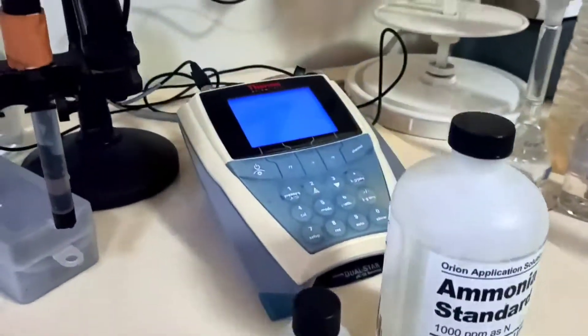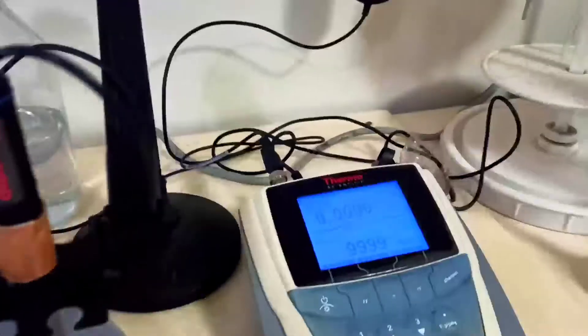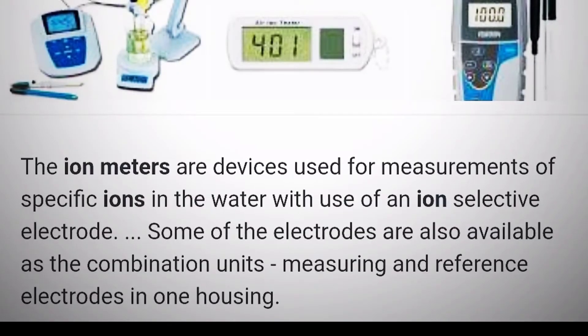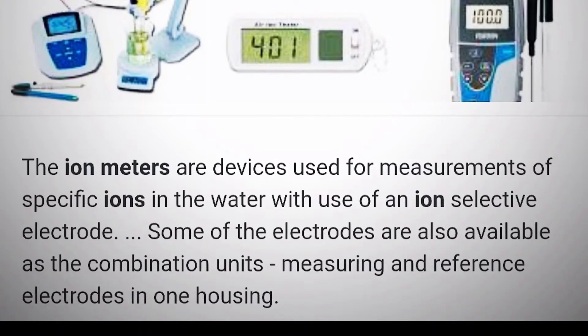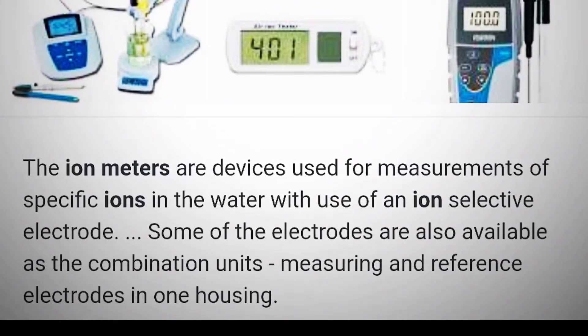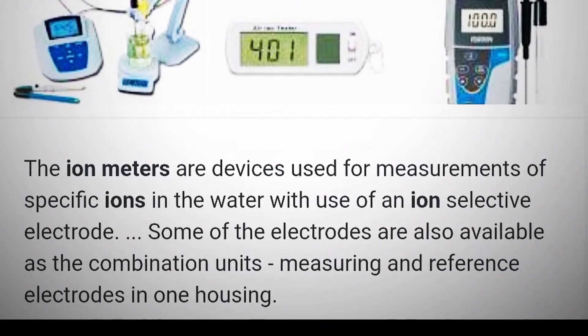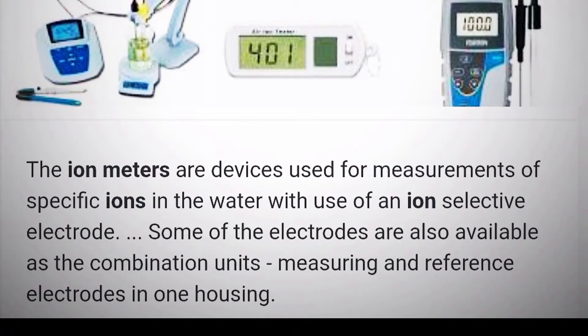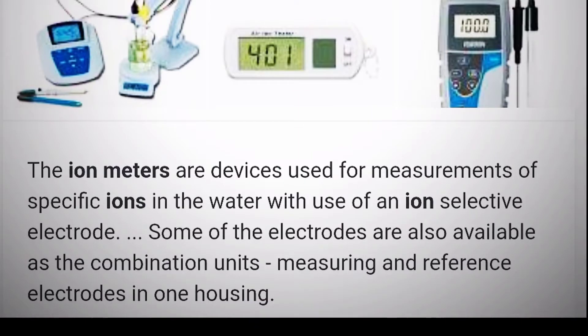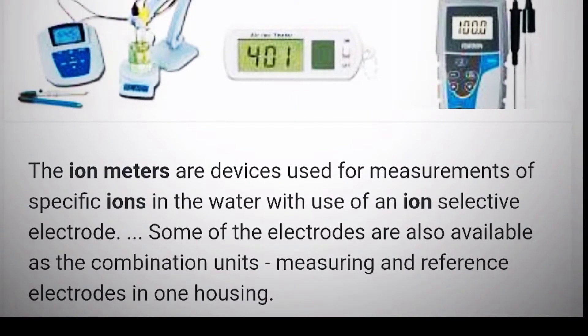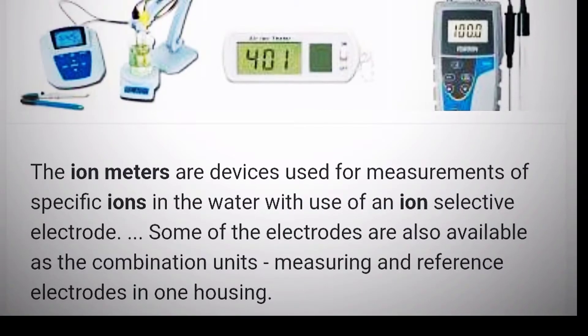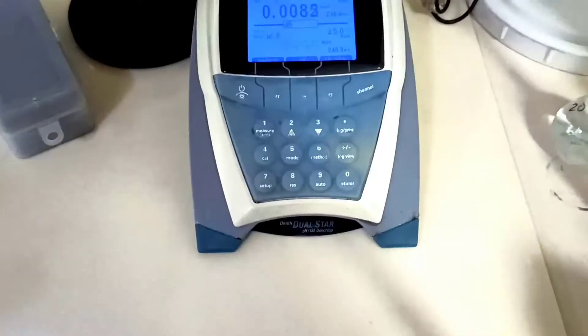This is the whole setup of an ion meter. Ion meters are devices used for measurement of specific ions in water with the use of ion selective electrodes. Today our ion selective electrode is ammonia. Some electrodes are also available in combination units, measuring and reference electrodes in one housing, similar to a pH meter. You can see the pH electrode, the reference electrode, and measuring electrode.